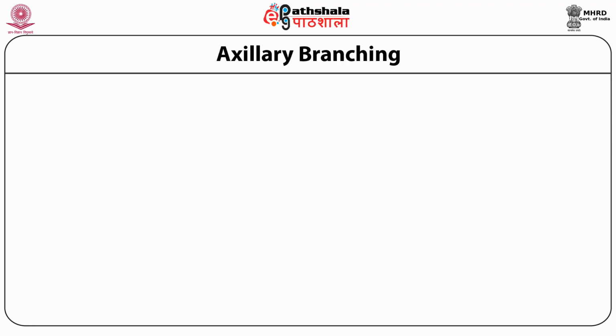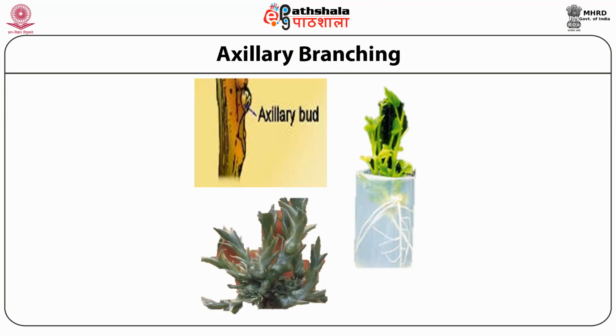So now we come to the method which is most commonly used in tissue culture, that is axillary branching. In the case of axillary branching, the nodal explants with axillary buds present are put on the media. Now initial bud break is very simple because the explant also has a lot of stored material, endogenous growth regulators and so on. And depending on the species, we either reduce the explant tissue gradually over 2 or 3 passages, or if we are lucky and we have defined the media, after the first bud break, you can actually remove the mother explant.